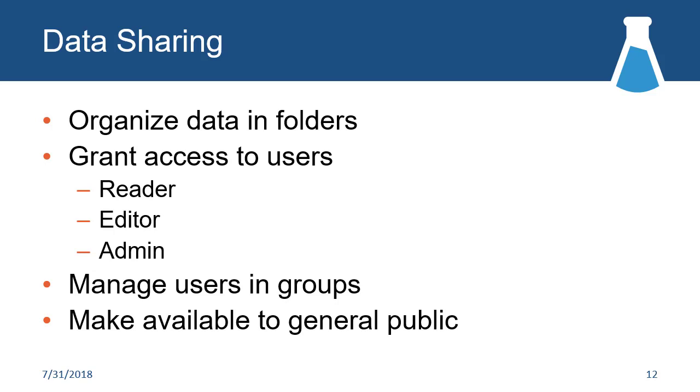And so on the server that the Eckels Lab hosts, that Panorama Web, you can either just make an individual folder public and say, hey, everyone can get at this, or we get you to set up kind of a full workflow to make it part of Panorama Public, which is a way to essentially make it part of the official supporting data, kind of supplemental data for publication. There's a whole workflow in there on giving reviewers access to it before it becomes fully public, and then kind of flipping it over into kind of post-publication mode.